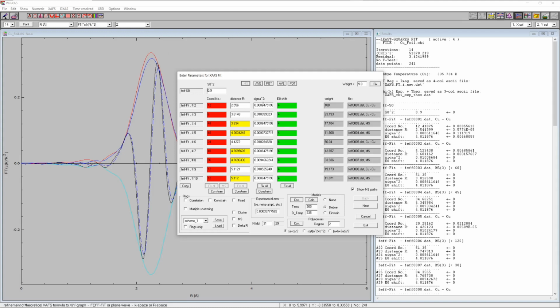And we want to refine the Debye-Waller factor. For this refinement, we do not want to use the Debye model and only refine one Debye temperature, but we want to refine the individual Debye-Waller factors for the single scattering shells. We do not want to refine all Debye-Waller factors of the multiple scattering part. Those are too many parameters. As we see here, we still have 31 free running parameters. That's too many. So we still need to use the same, and this is called averaging here.